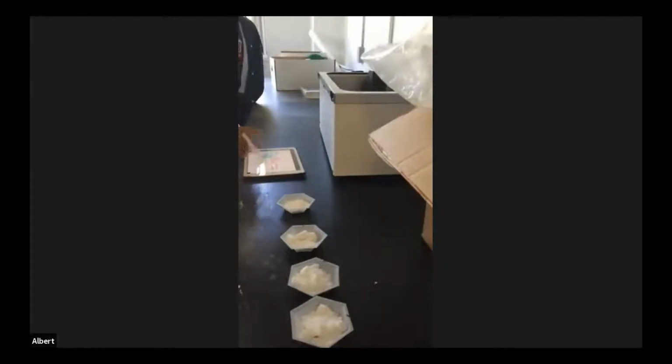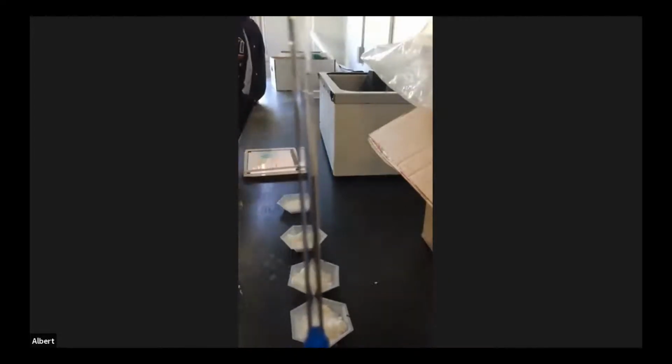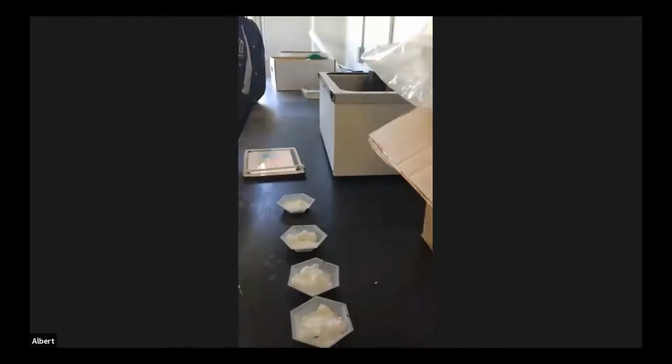So we have a NMR tube here. All right, it's just a little glass tube. And the way we prepare solids is we take a pipette, like so. I'm just going to go ahead and prepare the crude. And we just dip it into the crude and get a little bit of that material.